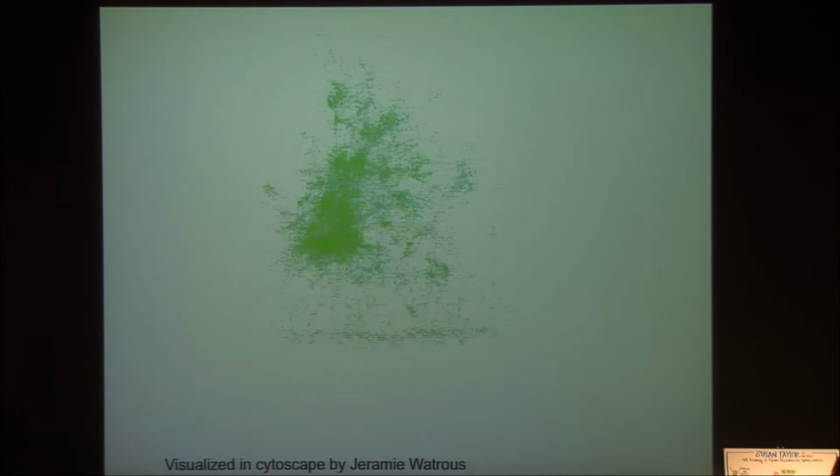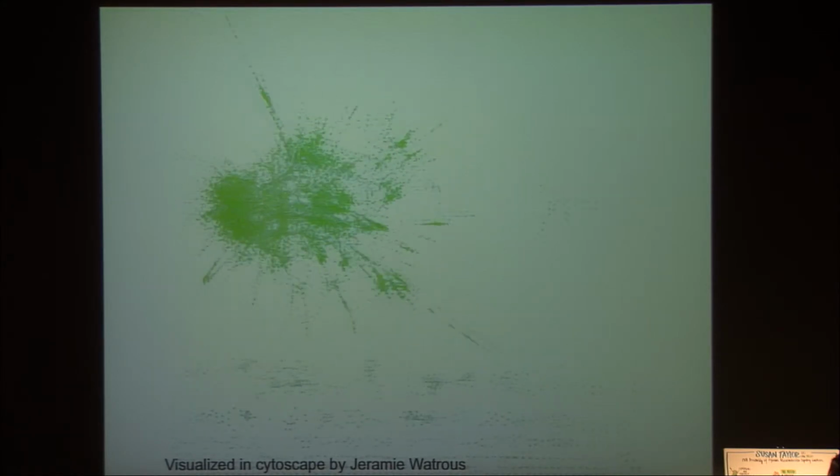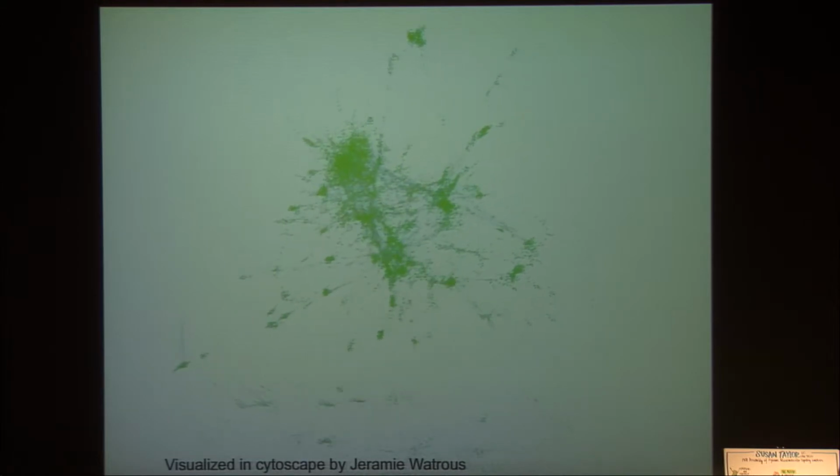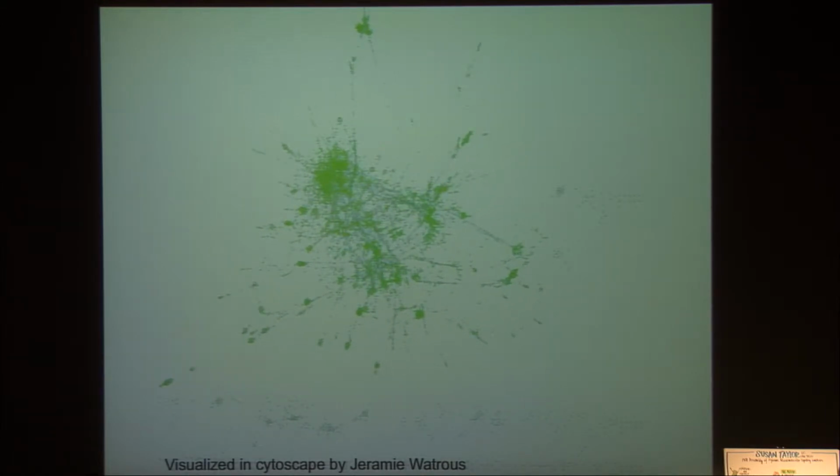But then we get this hairball, and really most experimentalists step back and say, this is too much. We can't really deal with anything like this. But nonetheless, they sometimes try, and that's what my laboratory tries to do. And then you can apply different algorithms to rearrange your data and sometimes make it visually more appealing, and really begin to pull out some of the chemistry that is embedded here.